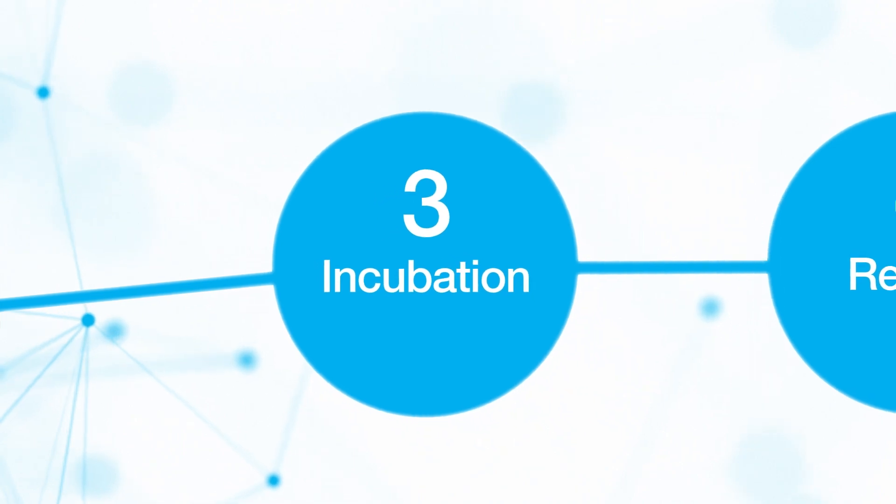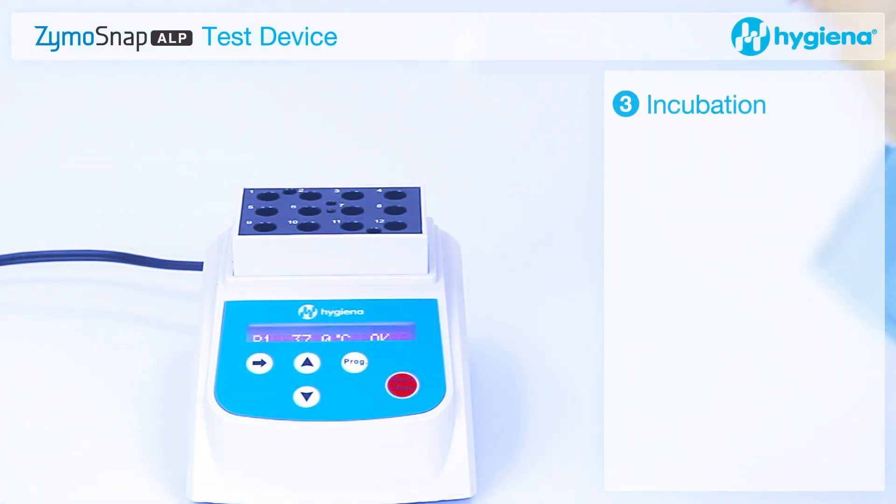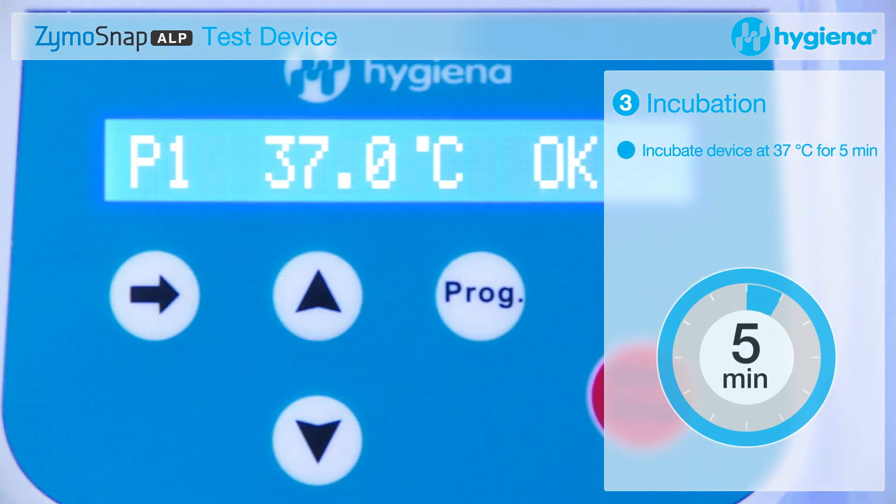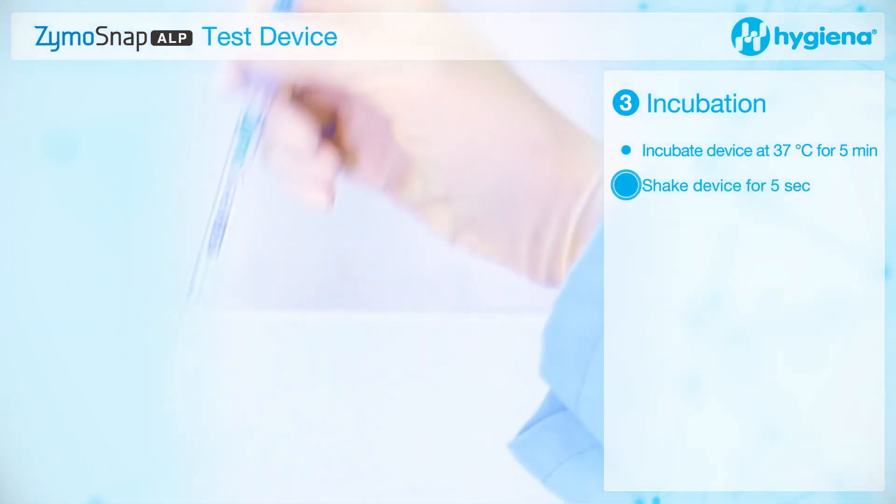Incubation. Incubate the device at 37 degrees for 5 minutes. When the incubation is complete, shake the device for 5 seconds to mix the sample and the reagent.